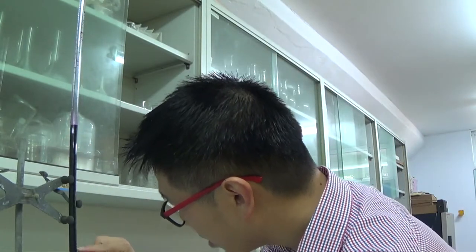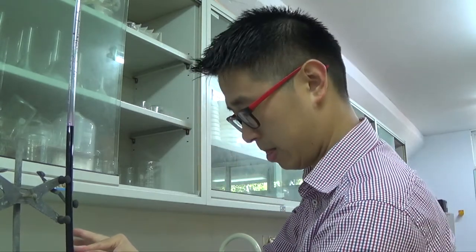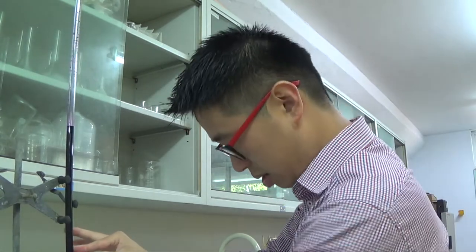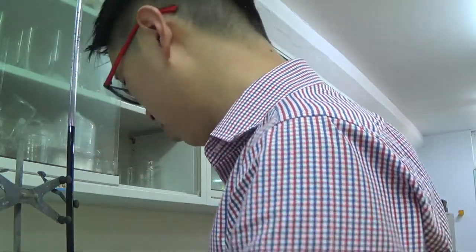42.5 is around here. So I'll just let it flow until it's around there. Oops, not there. I haven't prepared out anything yet. Okay, so I need to prepare out my solution.